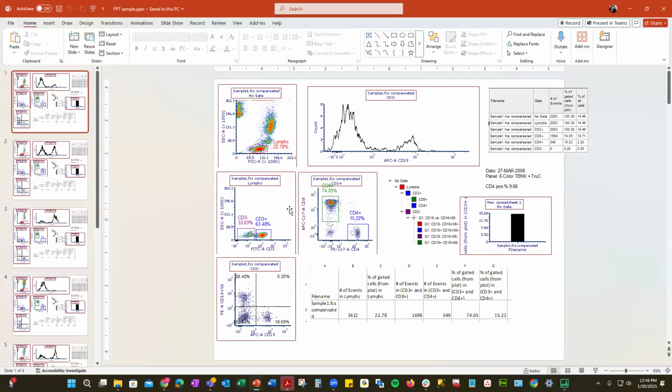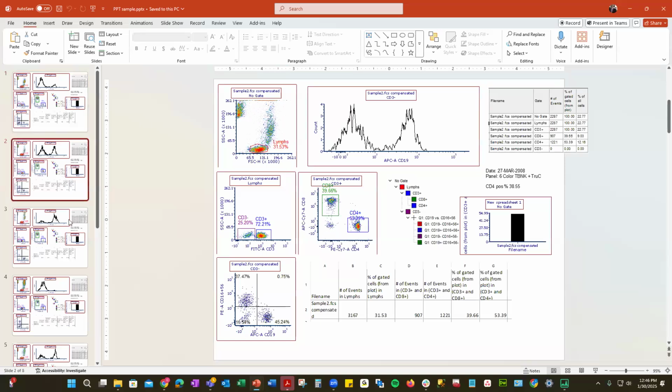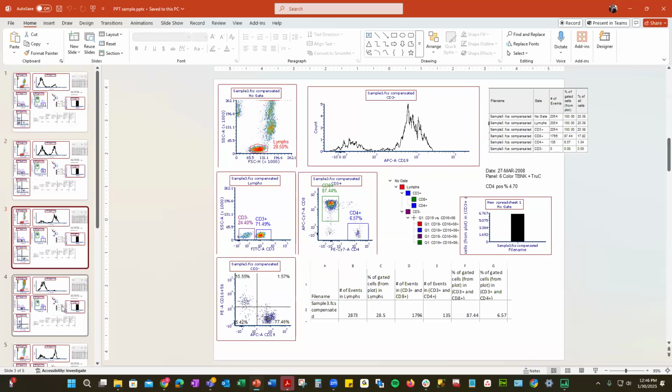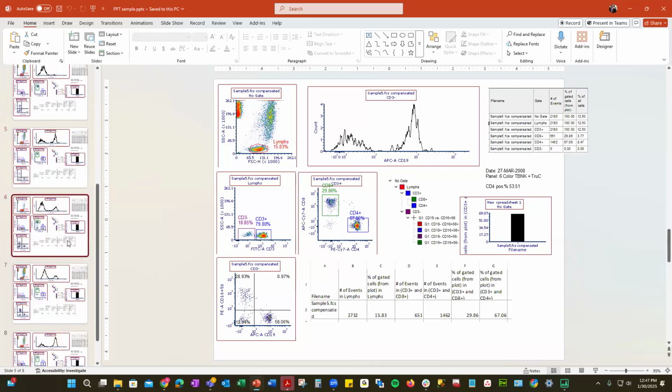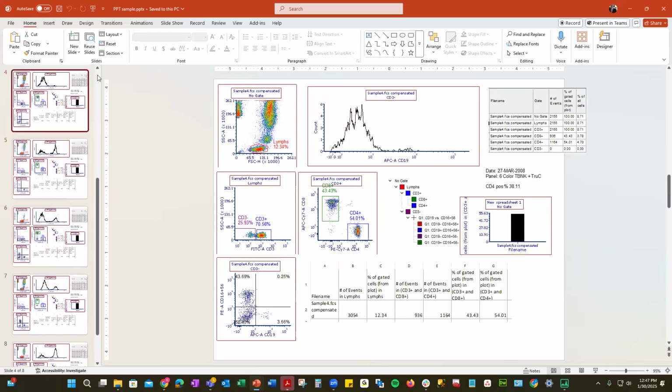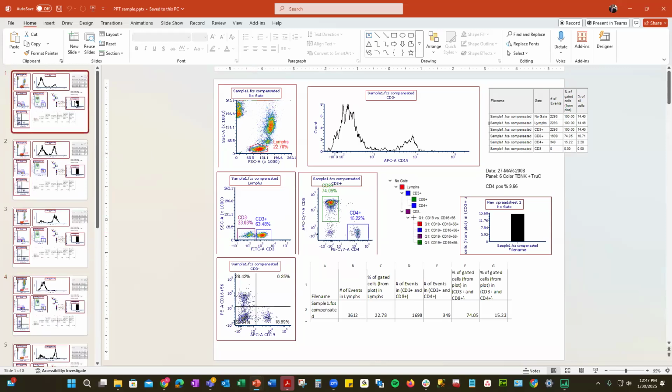Then I have the PowerPoint. So each of the pages for the PowerPoint are there. If we scroll down, let's see if it's saved as data specific. You can see it saved it there too. And that's nice. So this is really nice. It quickly can be done, right? I didn't do a lot of work to get this done.